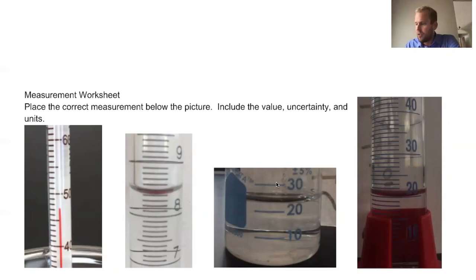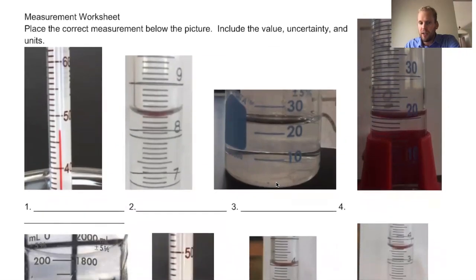I like to start with the beaker here. And if we look here, you notice the graduate here is going by tens. Okay, so the value of the graduate is going by the tens. So when we look at the water line, we look at the bottom of what we call the meniscus. So this is where we would read the measurement. When you're taking a measurement of a liquid, you got to make sure you're level with the table. So that's the bottom of the meniscus there.